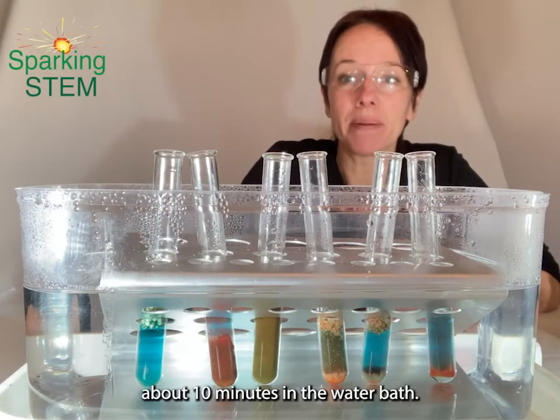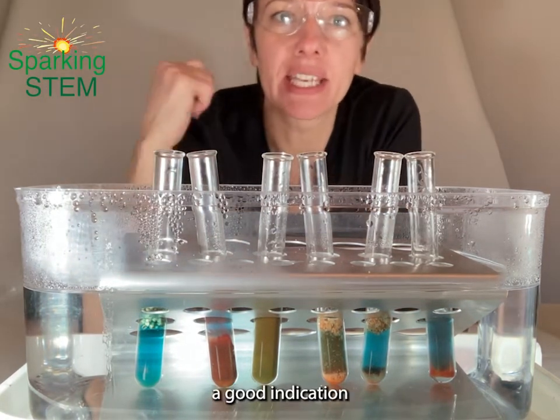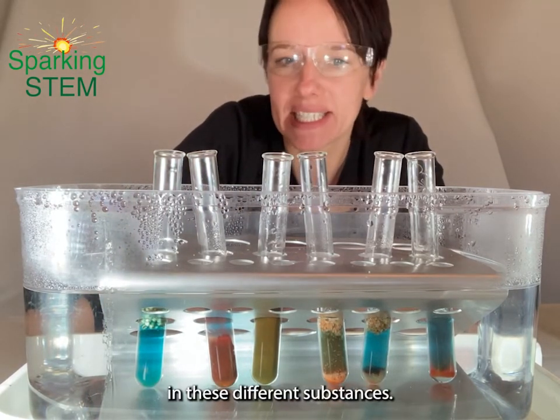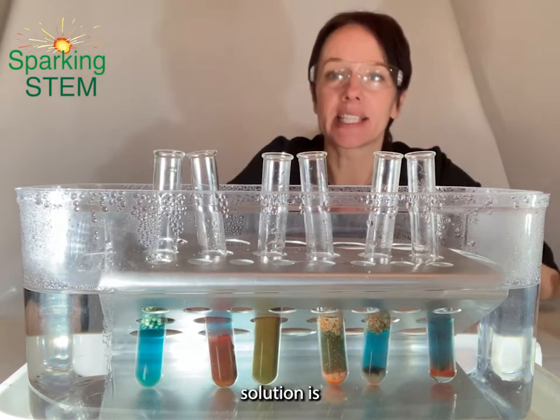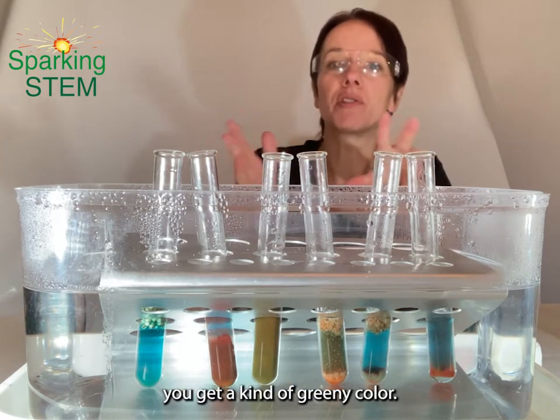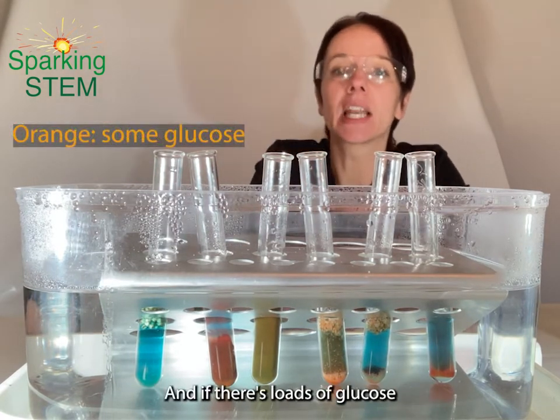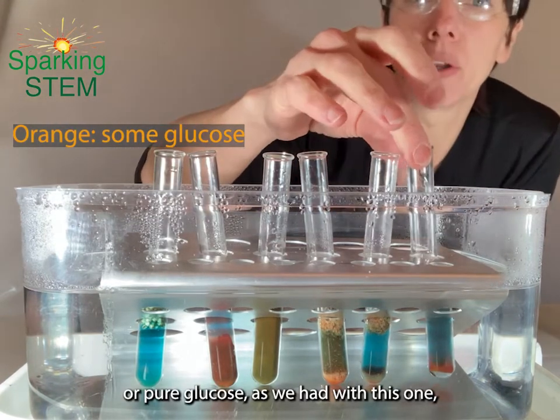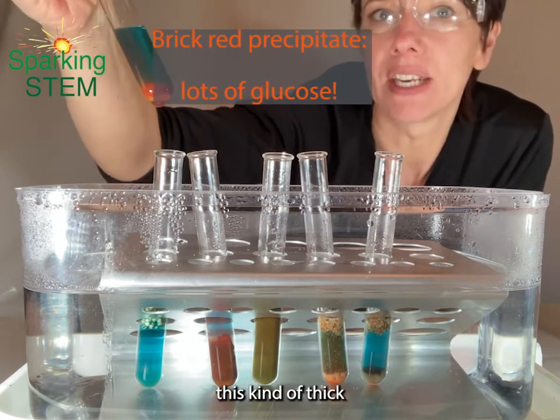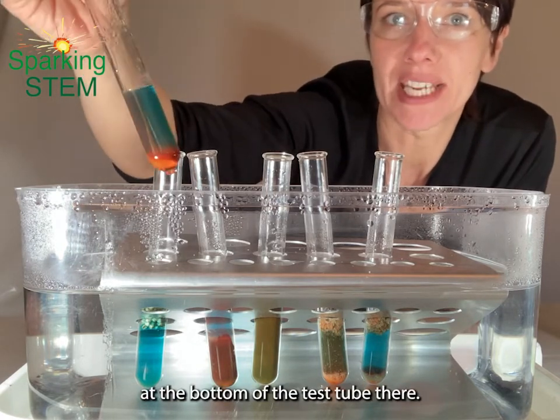Okay, so it's been about 10 minutes in the water bath now. Our Benedict's solution reagent has given us a good indication of the amount of glucose reducing sugar that's present in these different substances. The wonderful thing about Benedict's solution is it works a bit like a traffic light system: if there's just a little bit of glucose, you get a kind of greeny colour; if it's a bit more glucose, you get a yellowy orange colour; and if there's loads of glucose or pure glucose, we get what's called a brick red precipitate.